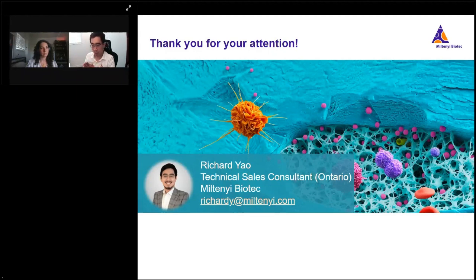Maybe sometimes it's actually a technician who is using the machine, or you would be able to have the hands-on experience using the cytometer directly by yourself. There'll be all different kinds of situations. But overall, as long as you get access to a flow cytometer, I'd strongly recommend you at least give a try to this assay kit and see how it performs. Okay, and it looks like we have one more question.